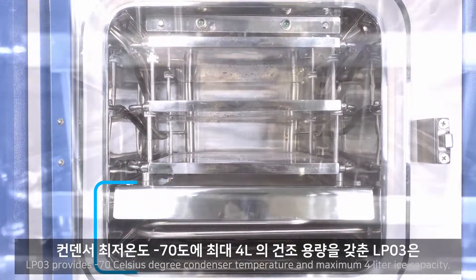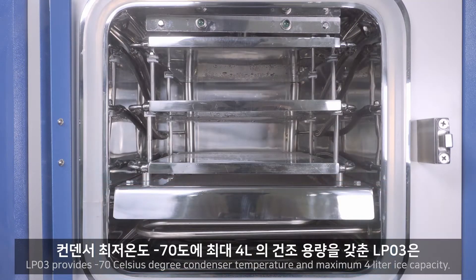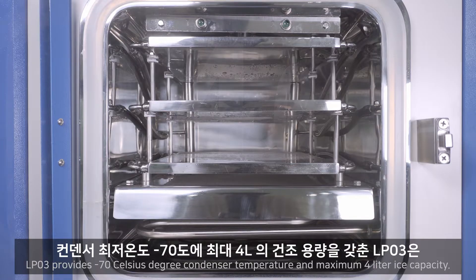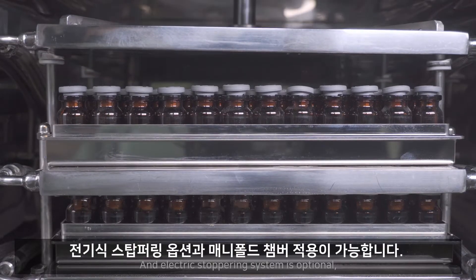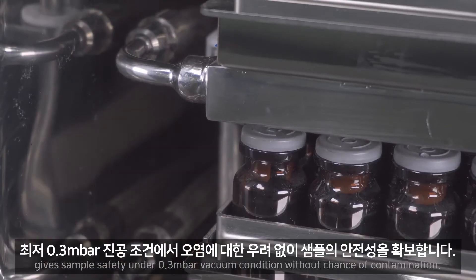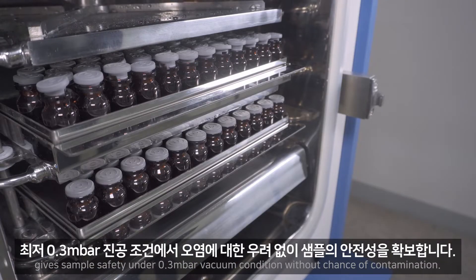LP03 provides minus 70 degrees Celsius condenser temperature and maximum 4 liter ice capacity. An electric stoppering system is optional. It ensures sample safety under 0.3 mbar vacuum condition without chance of contamination.